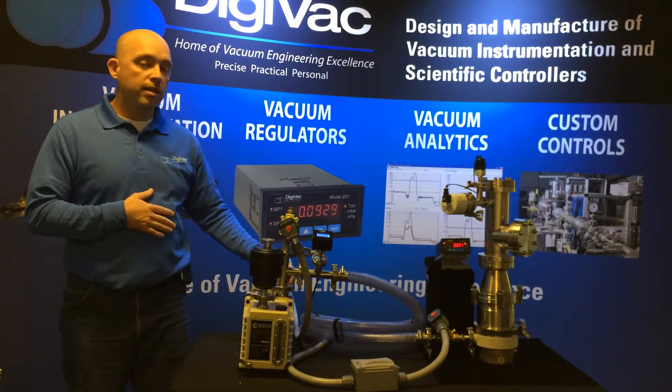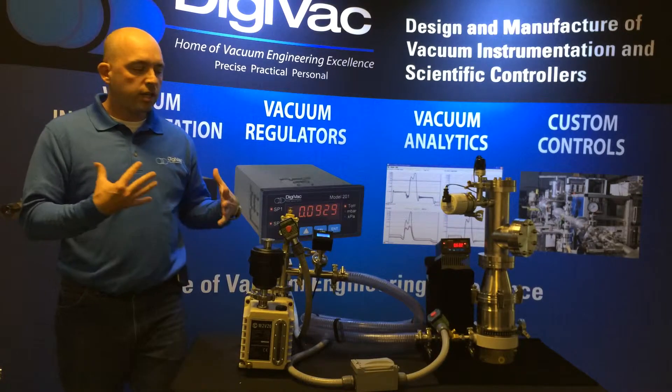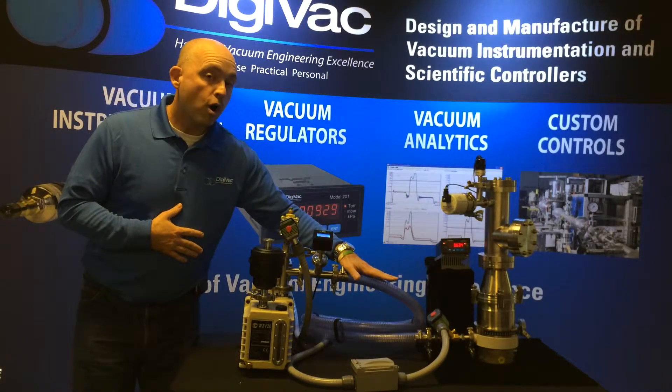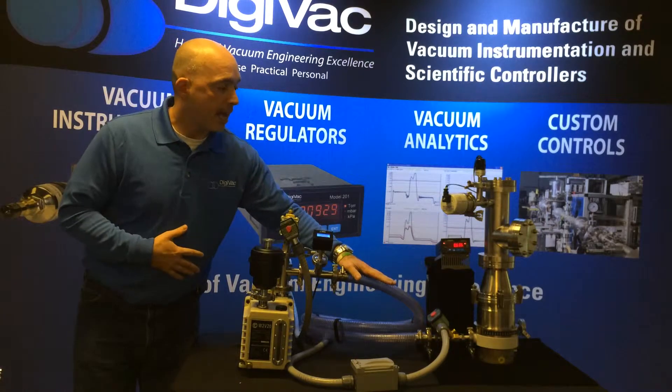So let's turn on this thing and see what happens. First thing that happens, the vacuum brake valve closes. Now our foreline is pulling down in vacuum.